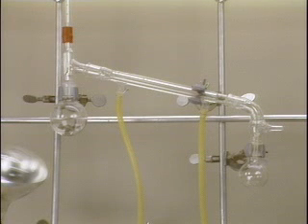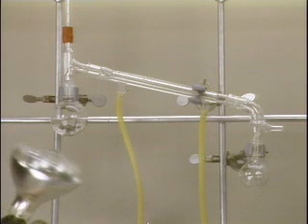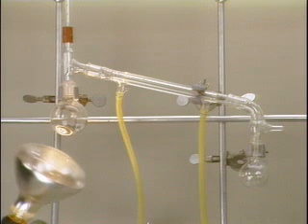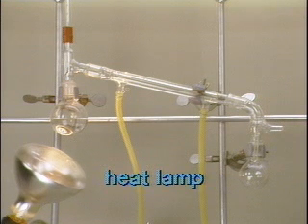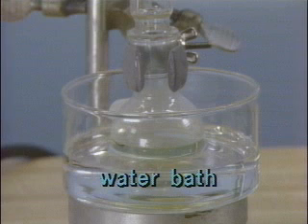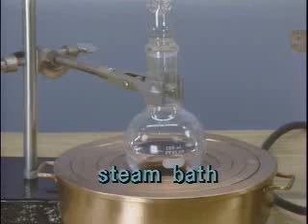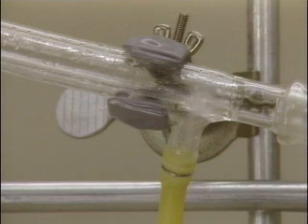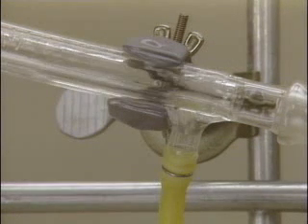A heat source is then placed under the round bottom flask. Several sources may be used depending on the equipment available and the expected boiling point of the distillate. Commonly used heat sources include a heat lamp, a heating mantle, a water bath, an oil bath, or a steam bath. Water passes through the condenser in order to cool the vapors as they come over during the distillation.